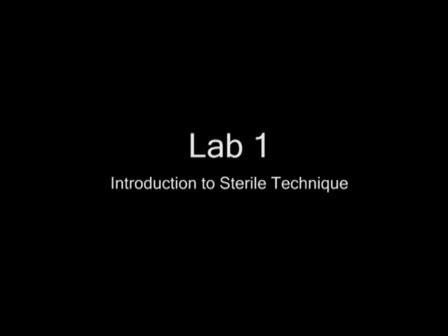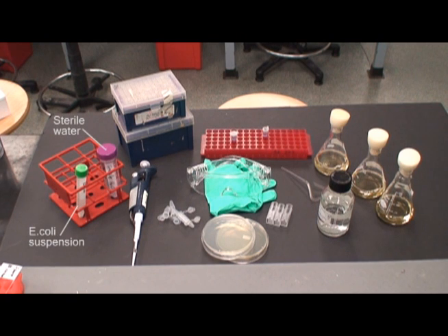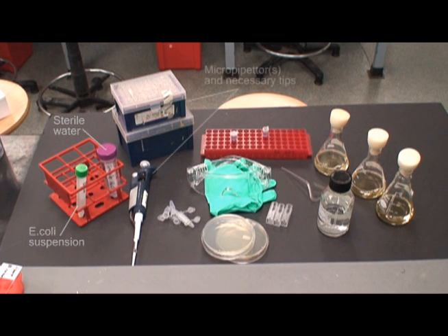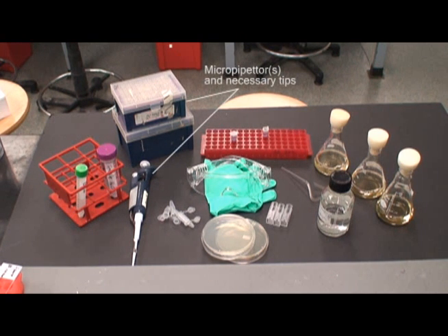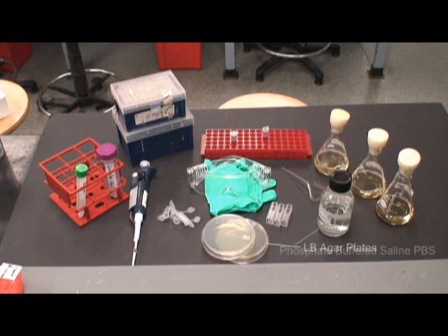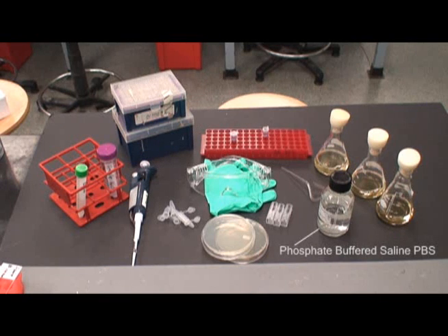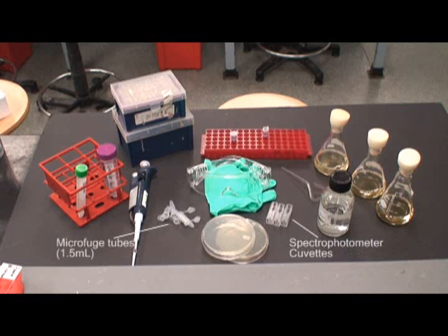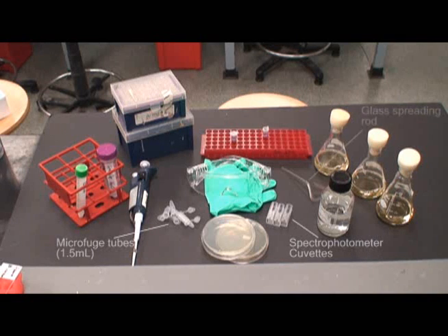Here is a list of materials that you will need for this lab. Sterile water and E. coli suspension, micropipetters and tips, LB agar plates, phosphate buffered saline, microfuge tubes and spectrophotometer cuvettes.